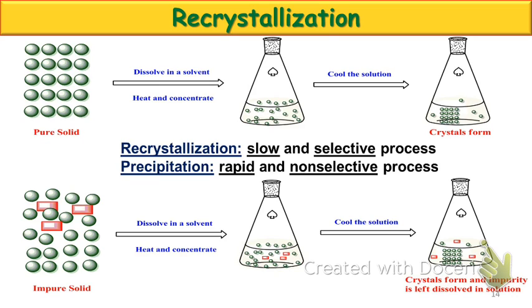So recrystallization. So that first image or series of pictures up top, would any of you attempt to do that procedure? Does it make sense to do that procedure? What was the goal of recrystallization? Purify. Would you recrystallize a pure solid? Okay, no, it doesn't make any sense to. Okay? So how would you know if it was a pure solid or not?